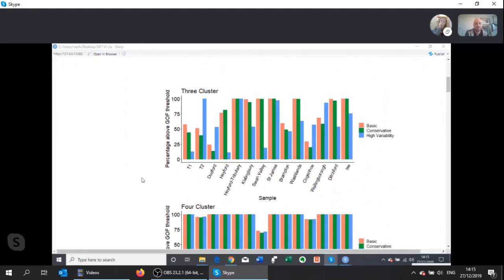So if you have a very low Goodness of Fit, it suggests that the tracers are trying to tell you some different things. That might not necessarily be a problem, but if these are all quite low, you might want to look back at your tracer data set and work out whether you have one tracer that's trying to tell you something different. One nice example might be, if we're doing the 3 cluster solution here, where our source groups are ironstone, urban, and the rest. If we've got one sample that's had a big input of limestone in it, which isn't represented in the source groups, we'll have calcium coming out with some really weird results for that source group classification. And because it's coming out with those weird results that aren't the same as the other tracers we're using, the Goodness of Fit will be lowered. So in that example, that's not necessarily a problem, but it does tell us something about the source groups we're using and the tracers we're using, which we might bear in mind when looking at the results or considering running it again, perhaps with some different source groups.